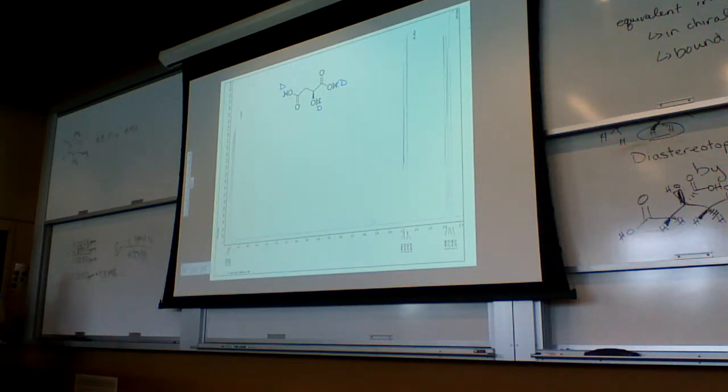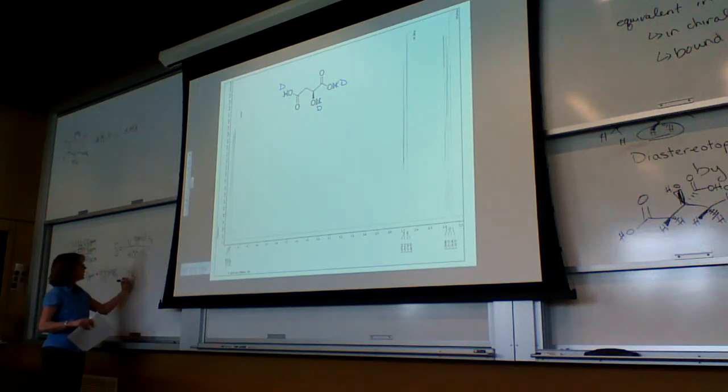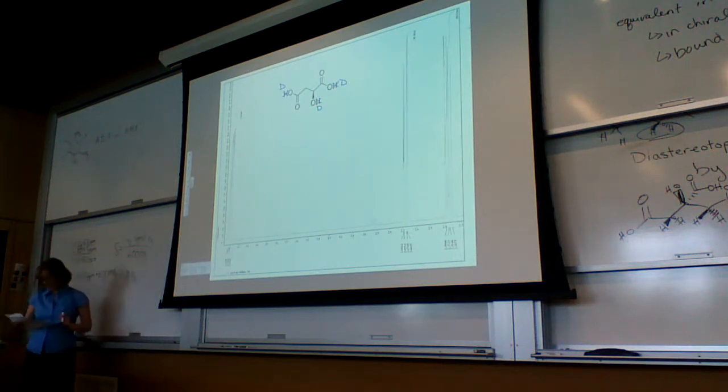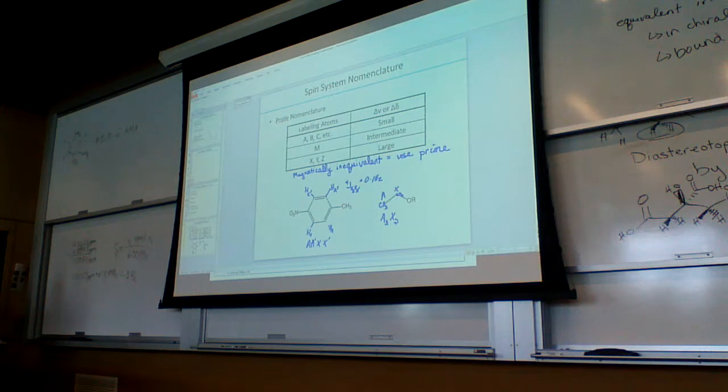What's that? Two? Yeah, I'm pretty sure this was done on a 600 megahertz. I'll show you why in a second. So there, now we got 3, which is the amount I measure when I look at the spectrum.